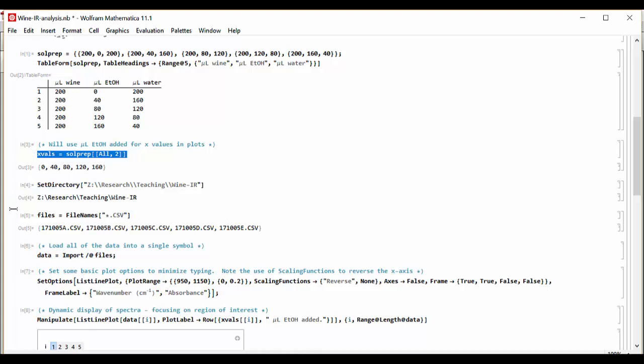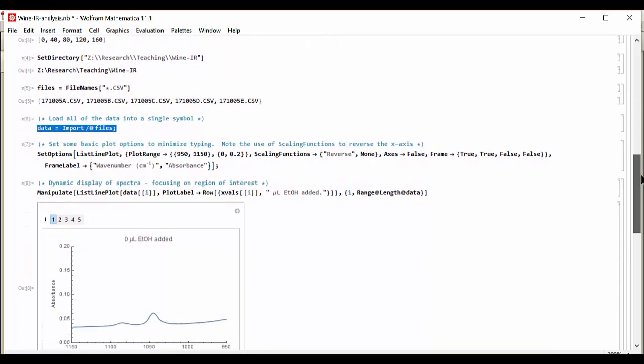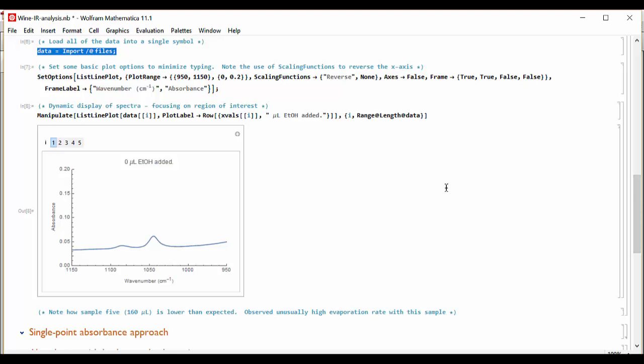After setting the directory and loading in the file names, each one of these data sets were acquired from the FTIR and saved from the FTIR instrument as CSV files. I can then fairly easily load the data such that all of the spectra are recorded in one symbol. This makes data processing a little bit easier since I'm applying the same tools to each file.